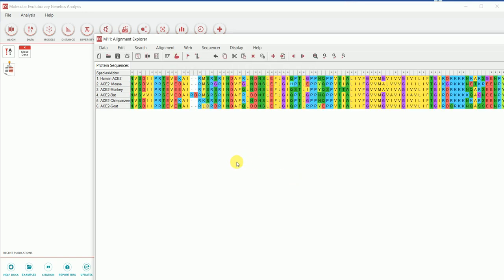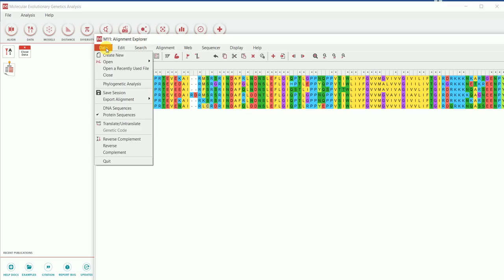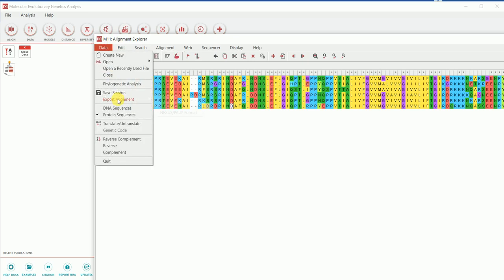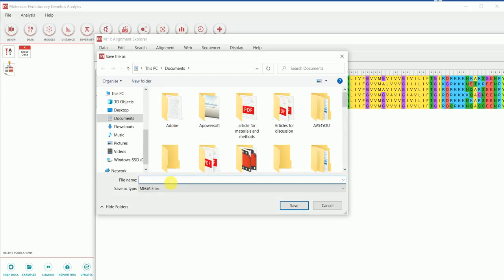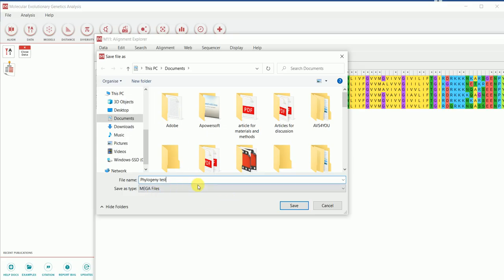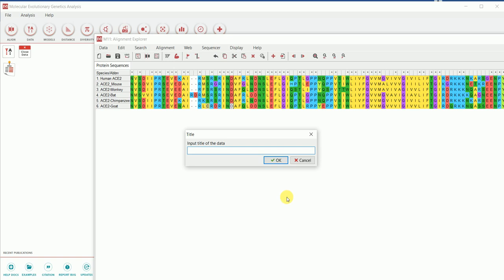The sequence alignment has now been performed using MUSCLE on my ACE2 protein sequences from different organisms. This next step is really important: go to 'Data,' then 'Export Alignment,' then select the MEGA format — since we're using MEGA software we must export in MEGA format. I'll save the file with the name 'phylogeny_test.' It will be saved as a MEGA file. You can give the data name anything; I'll call it ACE2.